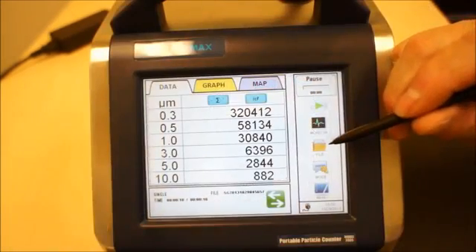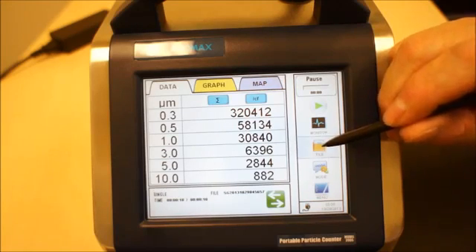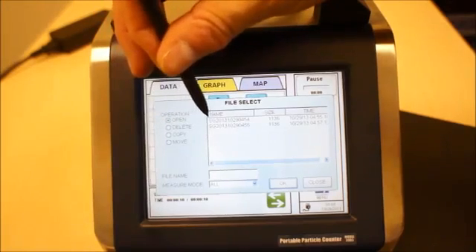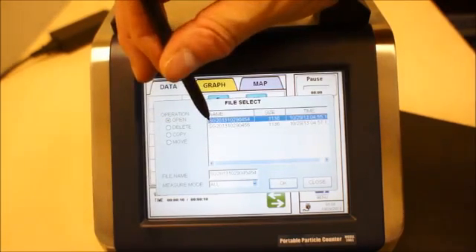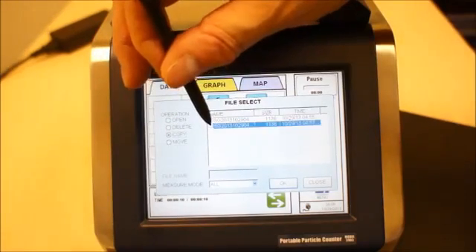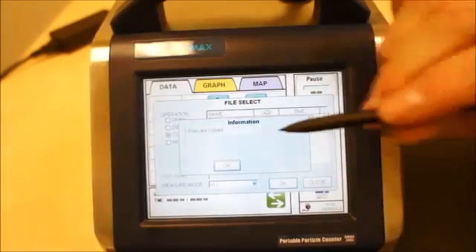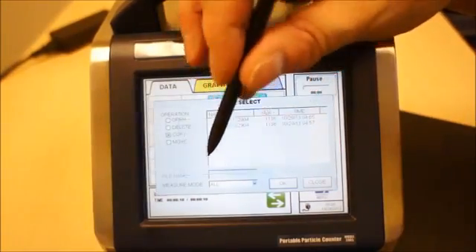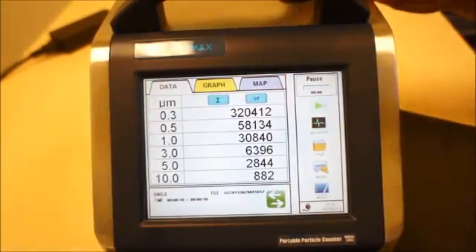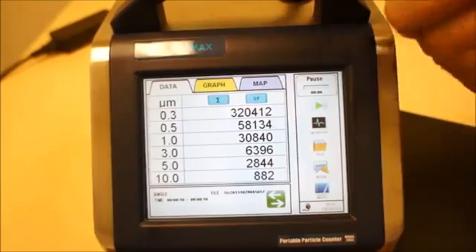This is a representation of how you can take data from the instrument by flash drive. You open the file, choose the file name, copy, then hit OK. When the file is copied, you can close. The data is saved on the flash drive behind the instrument.